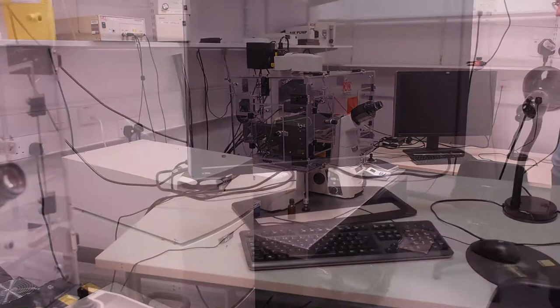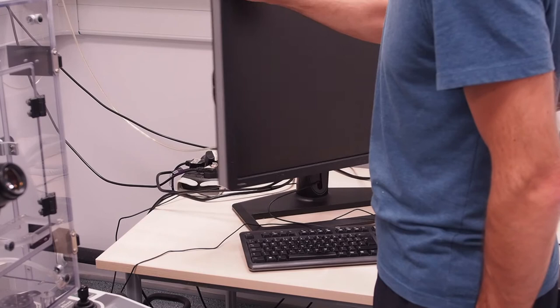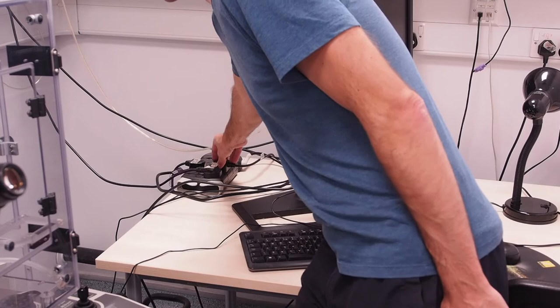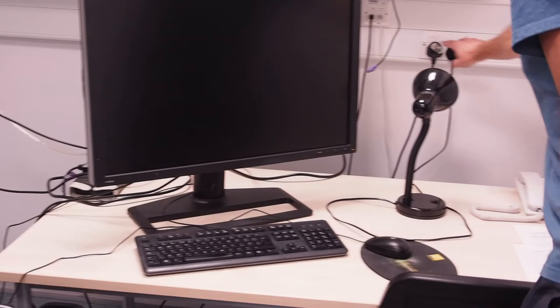Whilst the PC boots swing the monitor around to access the surge protected plug bank behind it. Plug in the plug labelled compressor. Swing the monitor back round and lastly switch on the wall plug labelled LEDs for the epifluorescence lamp.